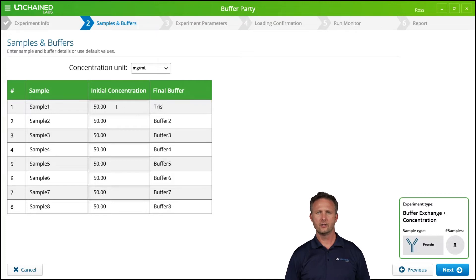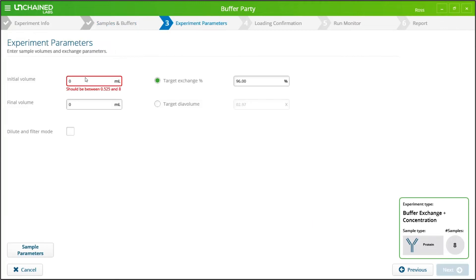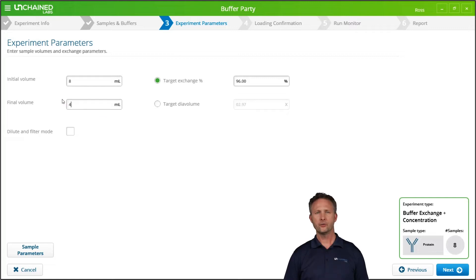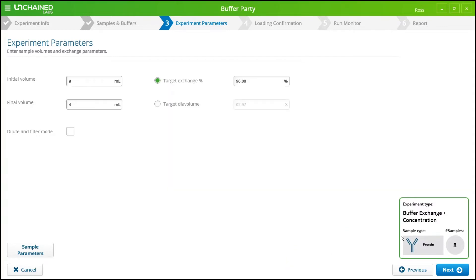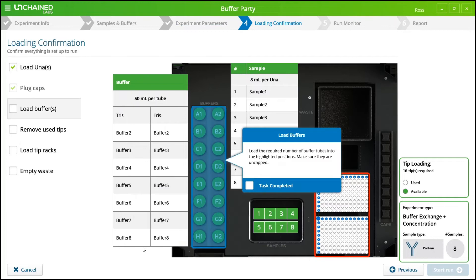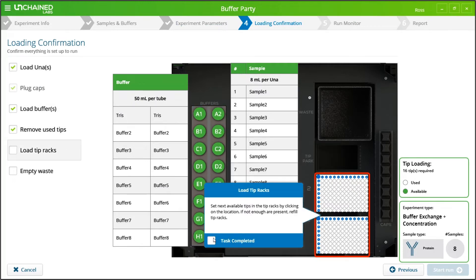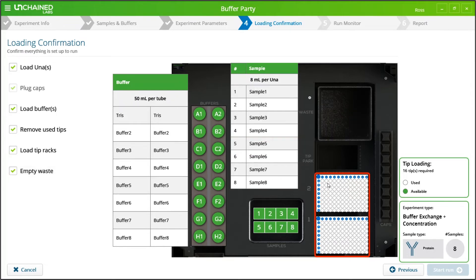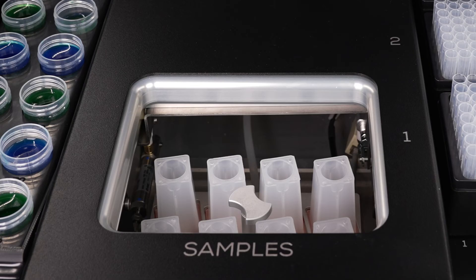Just click here to set your initial concentration and buffers. Unagi only needs to know a few parameters to do your buffer exchange for you, but you still have tons of flexibility to set sample parameters just the way you want. Unagi wraps everything up by giving you a loading confirmation, which displays what you need to have ready and where it goes on Unagi's deck. Click Start and Unagi is ready to roll.